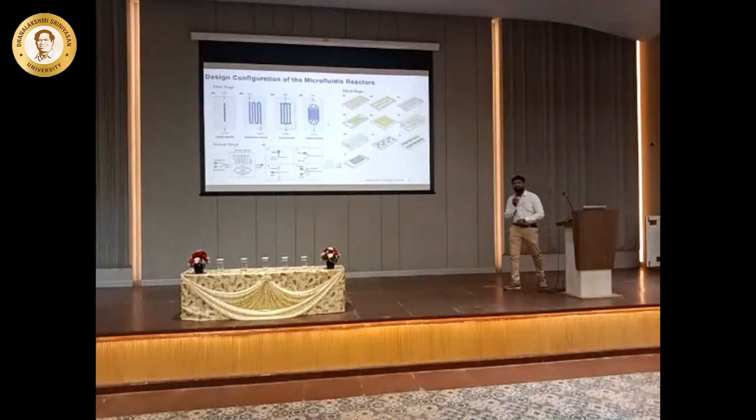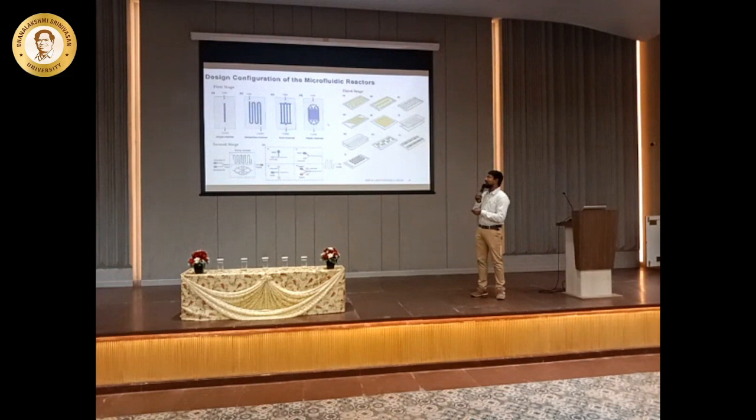So these are the different design configurations when you wanted to make. This is the first generation. If you see, there are different generations. You have one inlet, one outlet, and this one inlet and you have one outlet, but you have a serpentine structure. So what's the big deal in having these two designs? Do you think there's going to be a change? Yes, it's going to be a change wherein you want to mix it.